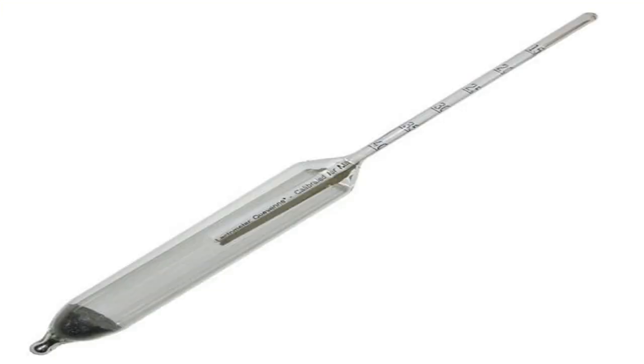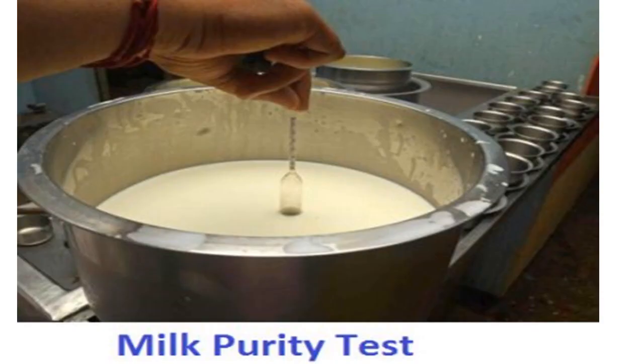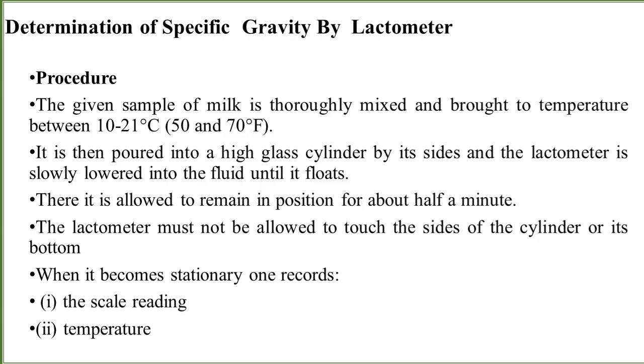This is the simple lactometer. And here is how we can use the normal lactometer for the purity test. Determination of the specific gravity by the lactometer. What is the procedure? The given sample of the milk is thoroughly mixed and brought to a temperature between 10 to 21 degrees Celsius.